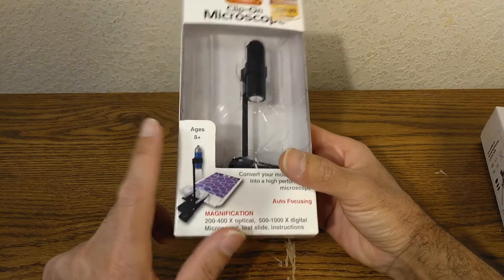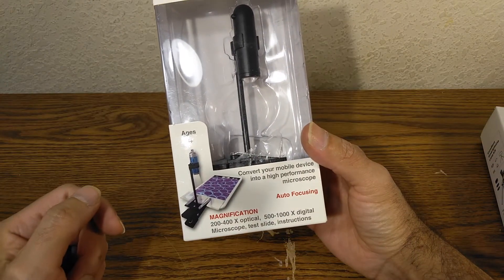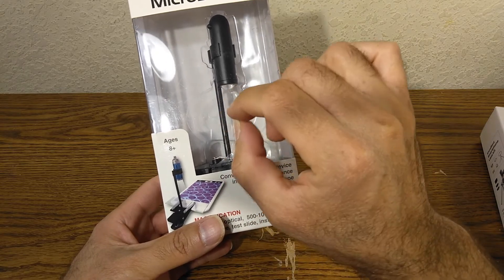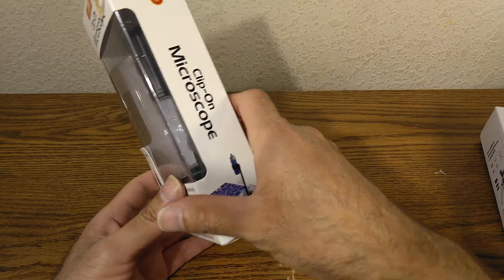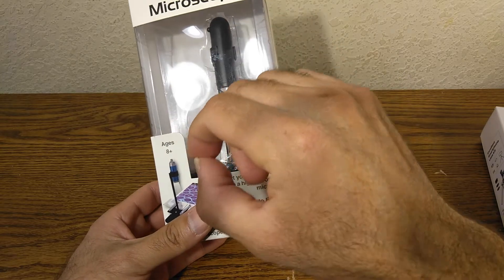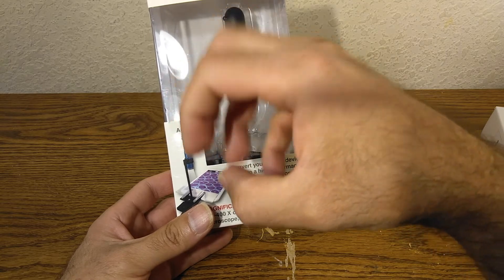The only thing you need to know about this is that this is only what I would call a light transmission microscope — it's not a light scanning microscope. The difference is that whatever you put on the sample hole has to be transparent; it cannot be something opaque, like a rock or a piece of metal. Anything that doesn't transfer light is not going to work well — you're just going to see the shadow, the silhouette on the image, but you won't see any details.